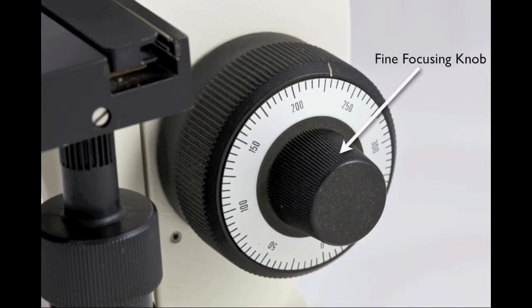The smaller knurled ring is the fine focusing knob. Turning this will move the stage in small increments. In this way, you can tweak the focus in small amounts until the object of interest is at its clearest.